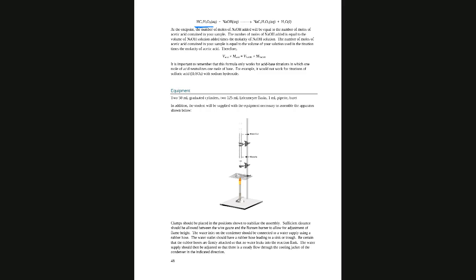So this is the second titration. And why did I say you have 3 titrations? Well, because when you start the reaction, you basically add 20 drops of sulfuric acid in order for the reaction to be faster.